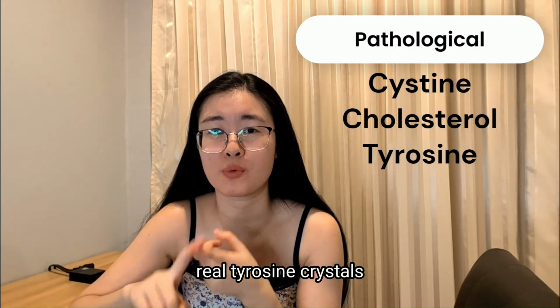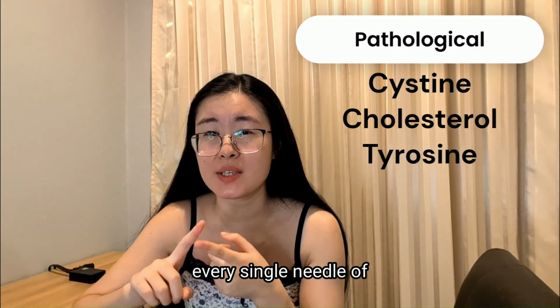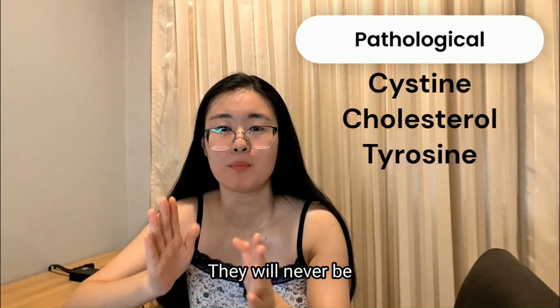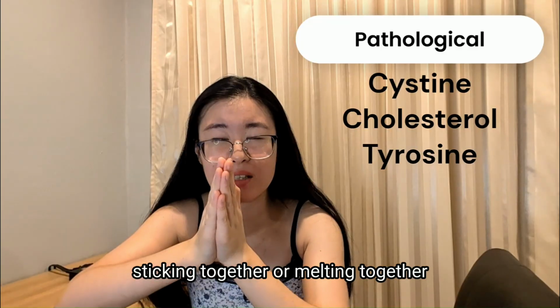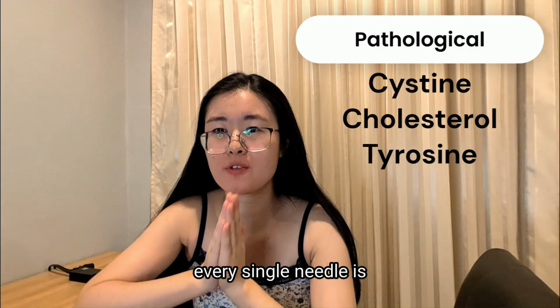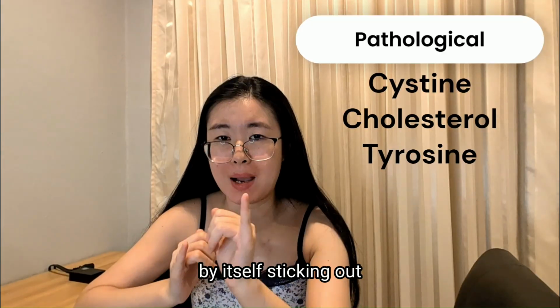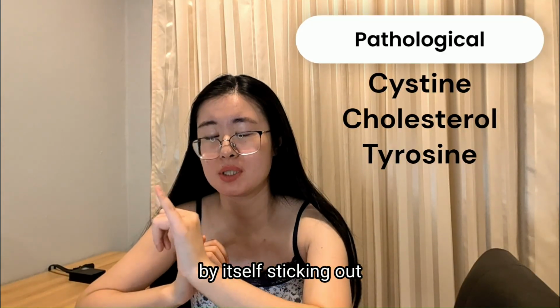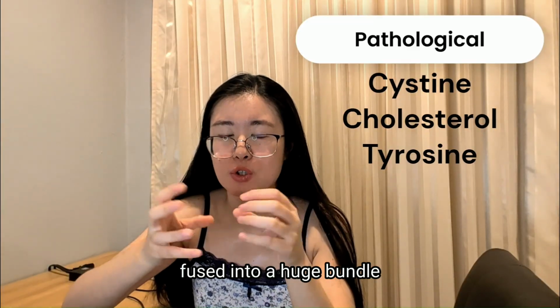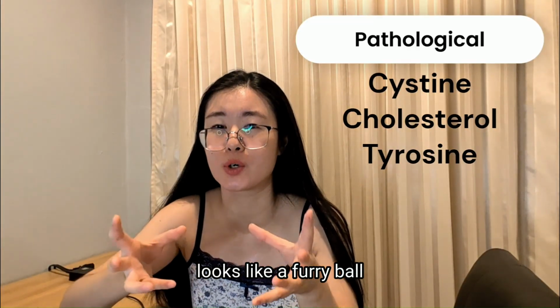When you see real tyrosine crystals, every single needle sticking out has a very clear shape. They will never look like they are sticking together or melting together. You will absolutely see every single needle by itself sticking out. They will never look like they are fused into a huge bundle, like a furry ball.